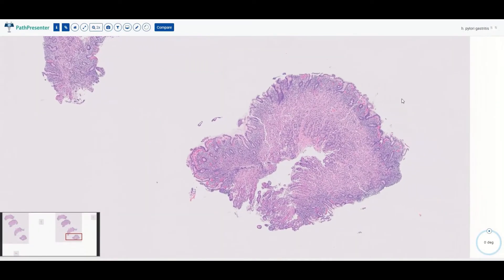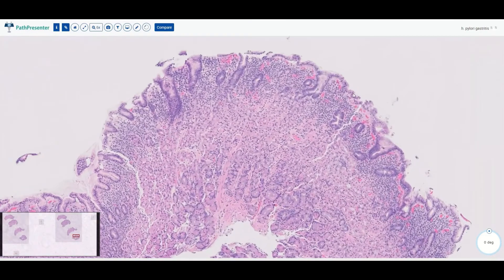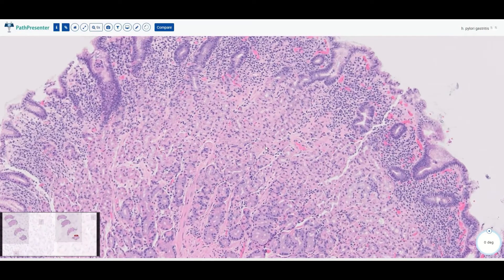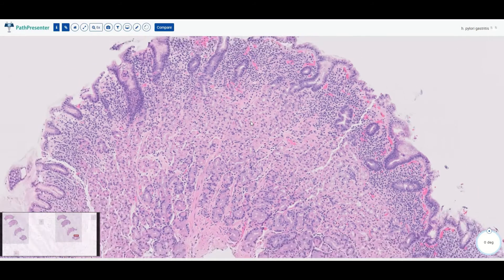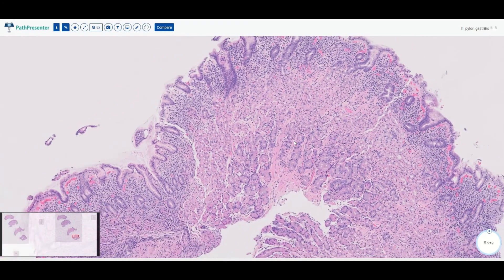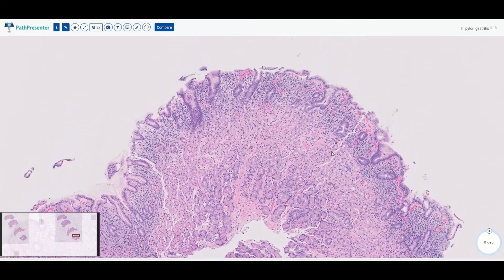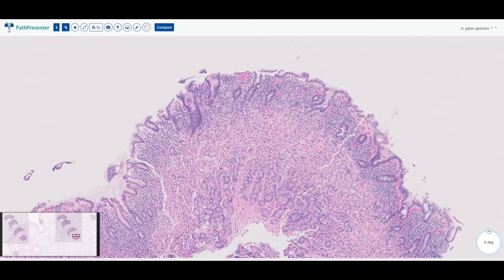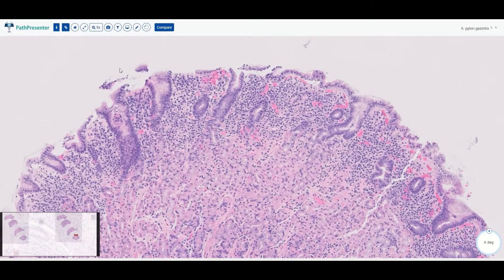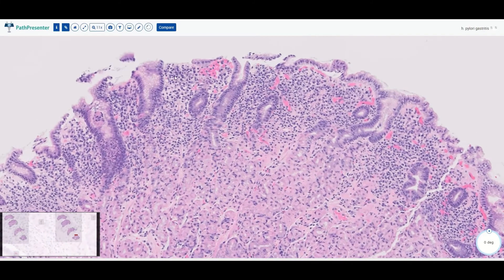Now we have another stomach body biopsy — you can tell it's stomach body because on the surface you have foveolar epithelium and deep down the mucosa is filled with glands containing parietal cells. So we are in oxyntic mucosa, commonly found in the stomach fundus and body. Does this remind you of what we saw a little bit earlier? It has some sort of reactive look to it — you can see the glands here are darker colored and there's some mucin depletion. But completely unlike the previous case with chemical gastropathy, you can see an abundance of inflammatory response here at the surface.